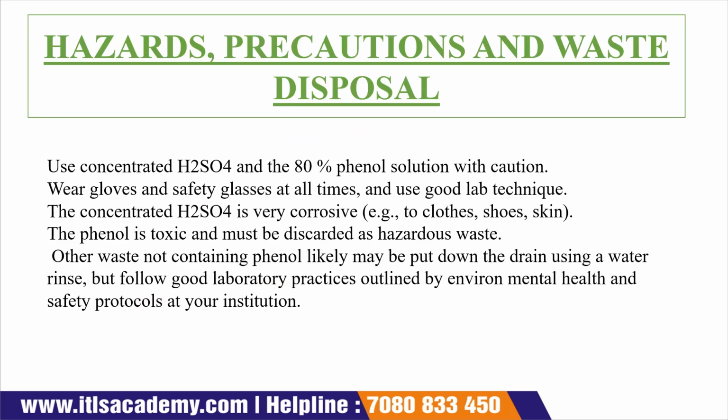Now the next one is the hazards, precautions, and waste disposal related to this experiment. We all know that we are using concentrated H2SO4, and along with it we are also using the 80% phenol solution. These two solutions are very crucial, and we have to take care before handling them. We have to wear gloves and safety glasses at all times, and follow the other essential laboratory practices.